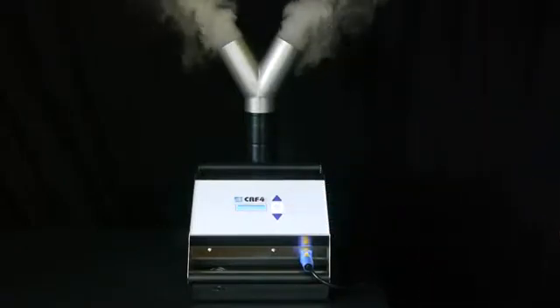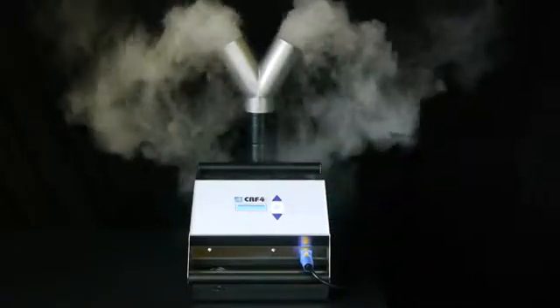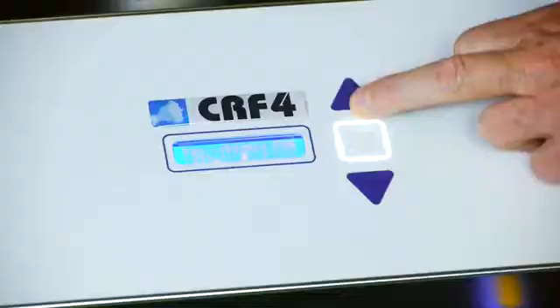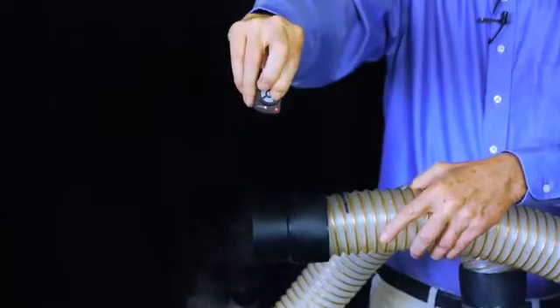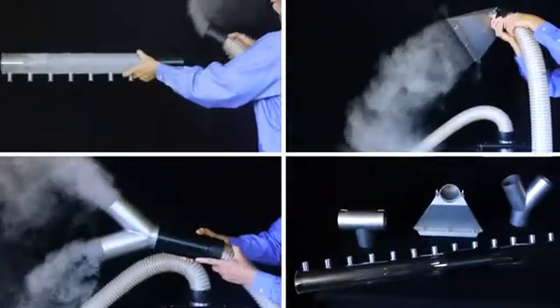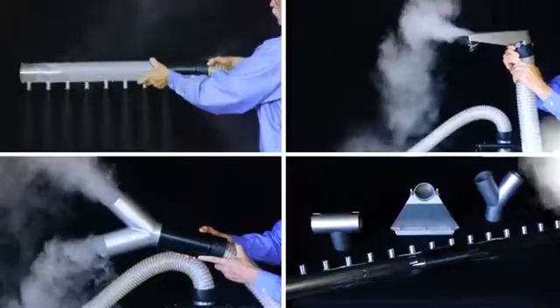The CRF4 Cleanroom Fogger generates high levels of pure fog without using LN2, adding adjustable fog volume, adjustable airflow velocity, touchpad control, and wireless remote control. It produces as much fog as comparable LN2 foggers, yet it's easier to operate with better accessories and costs less than LN2 foggers.